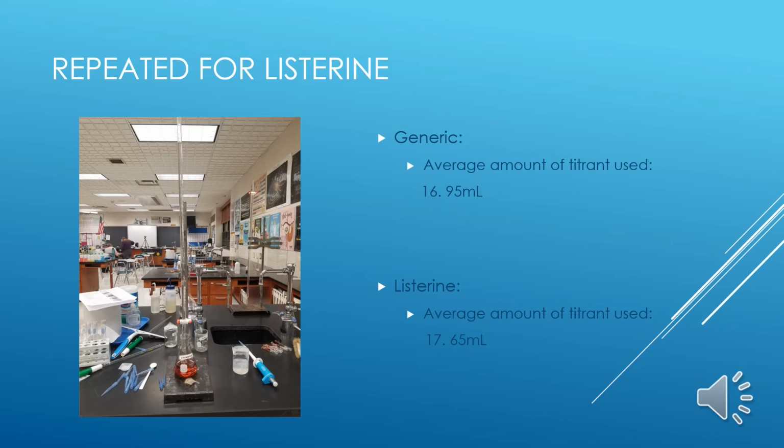I then repeated the same process for Listerine. It took about 16.95 milliliters of sodium thiosulfate to neutralize the generic, and about 17.65 milliliters to neutralize Listerine. And this is a picture of the setup of the titration.